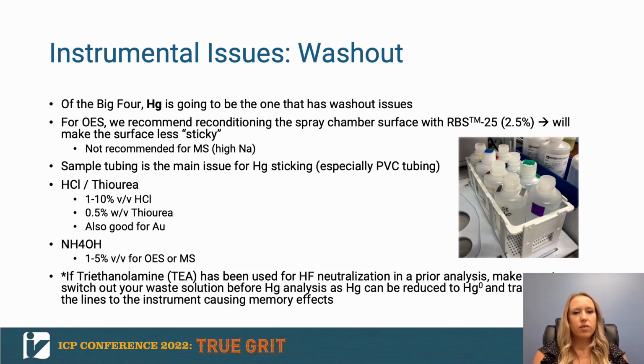Another thing that we recommend doing is replacing your PVC tubing or your peristaltic pump tubing if you're seeing high carryover or high washout, as this is going to be the major culprit for where those sticky elements are going to accumulate.